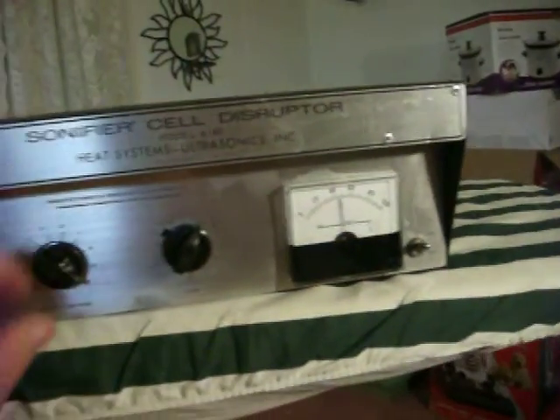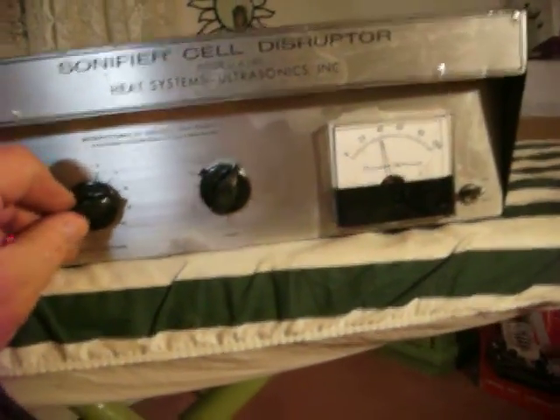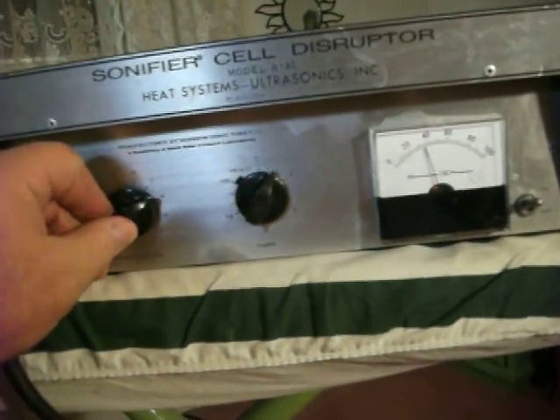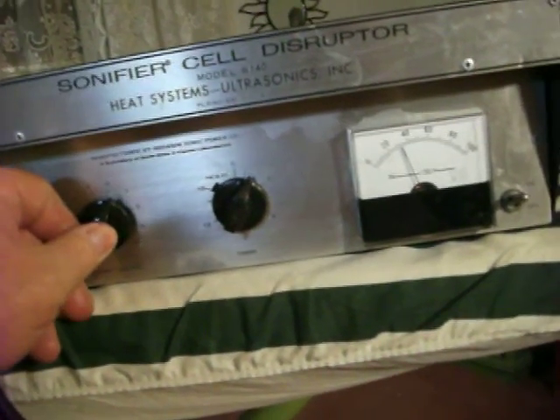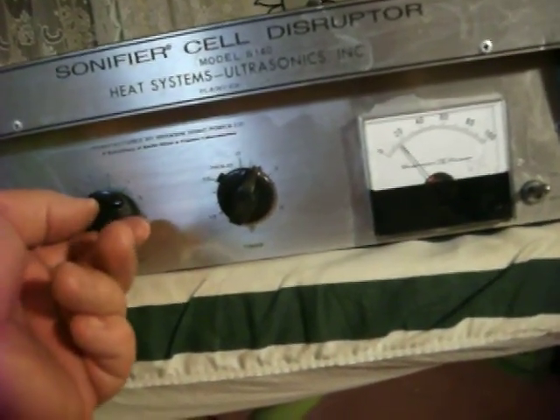Now the dial's all the way up, and this dial's all the way up. The gauge is all the way up. See the gauge is responsive as I turn the dial.